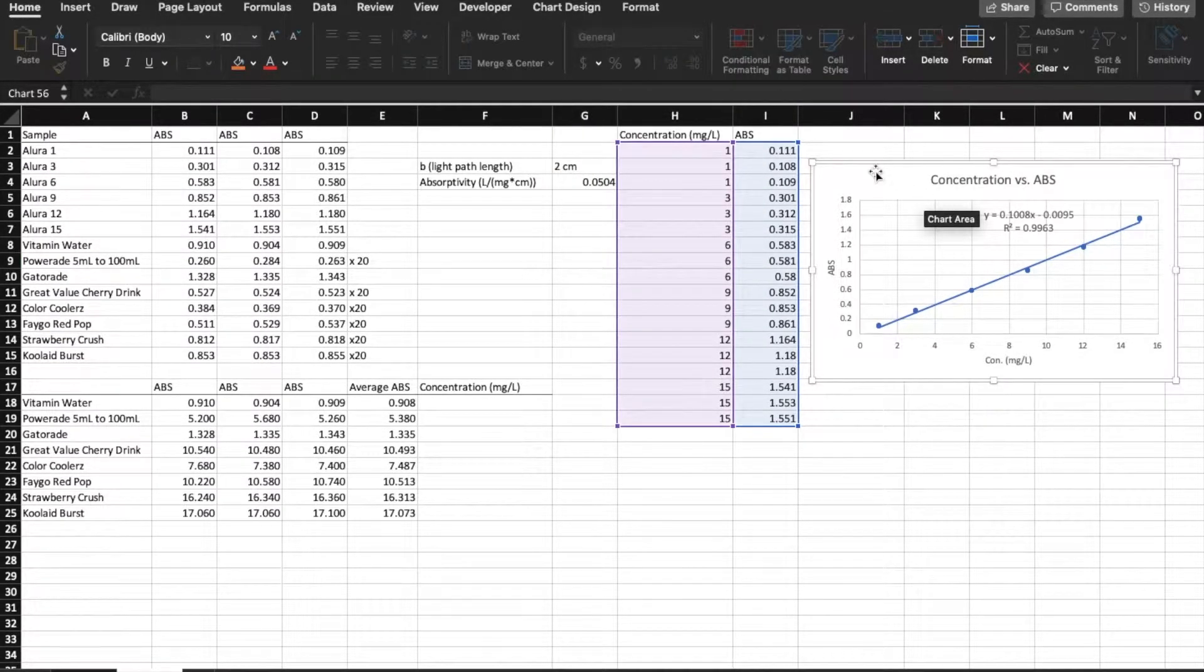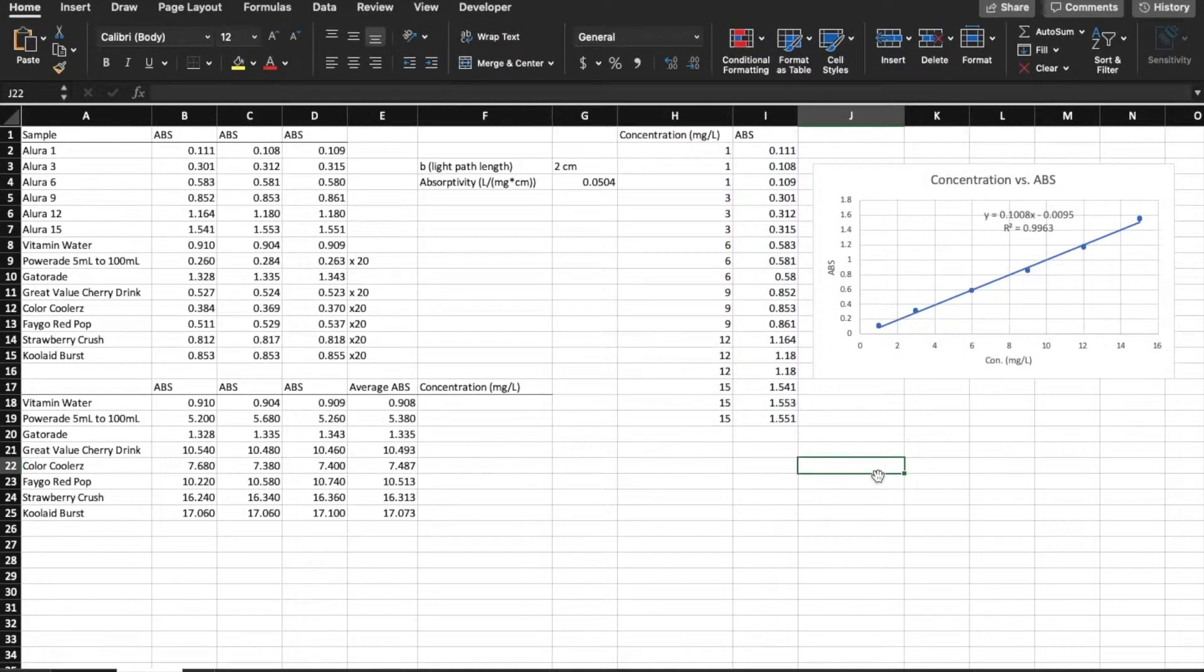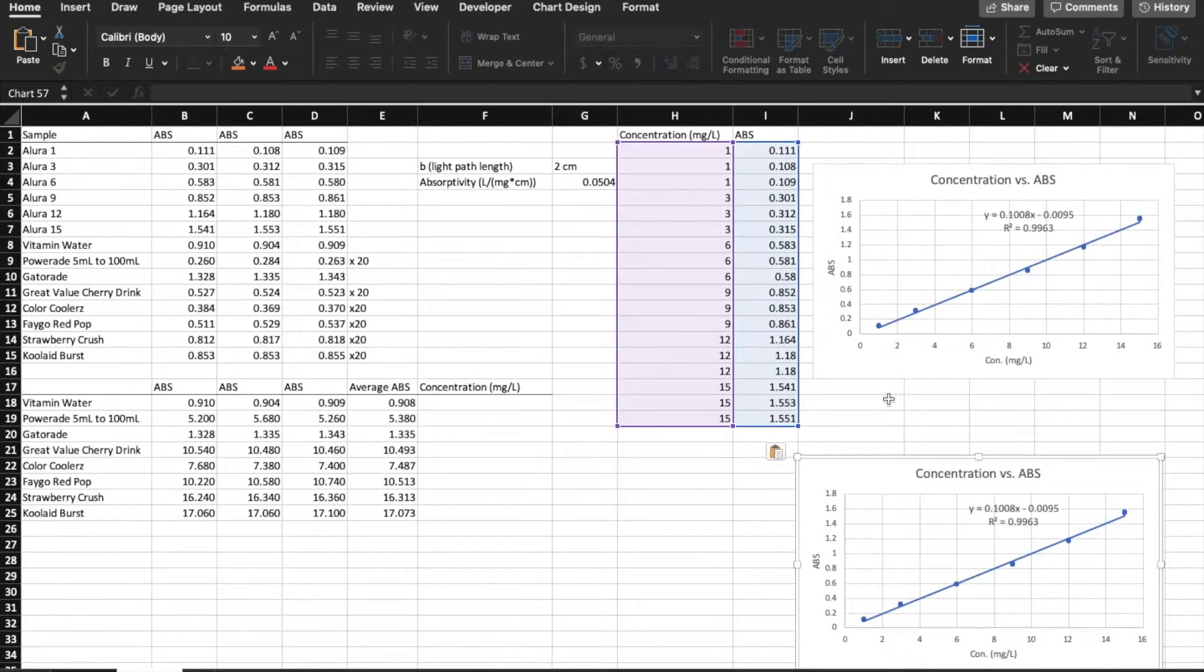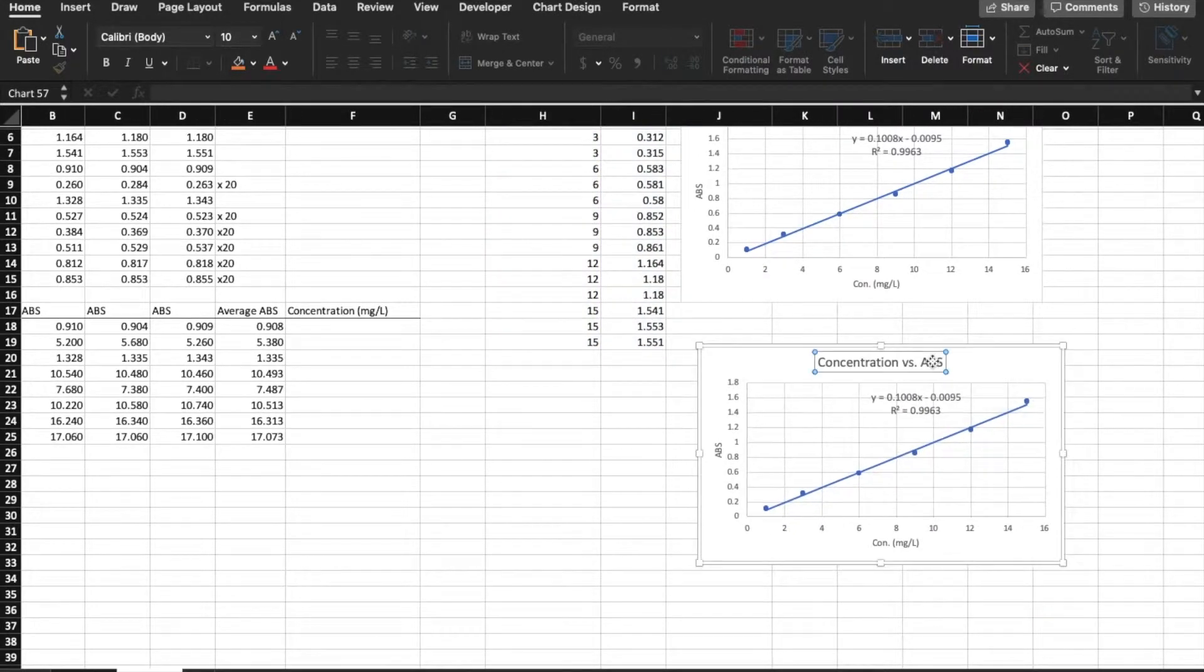So next, I'm going to copy this graph and I'm going to paste it down below it. This is simply just so I don't have to do all the work I did before. And I'm going to change this to absorption versus concentration. So this time the absorption is going to be on the x-axis and the concentration on the y-axis. This is the standard curve and this is going to help us find the concentrations of the other solutions such as Gatorade and Powerade and all that stuff.